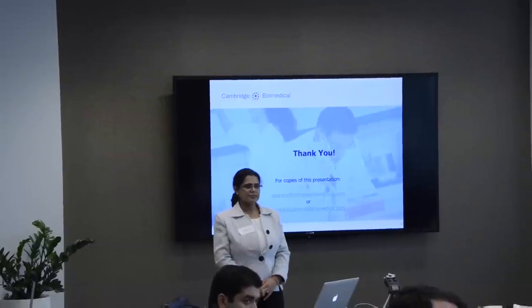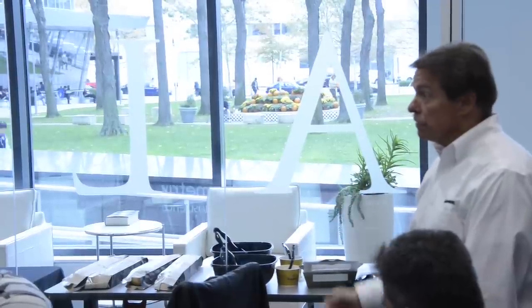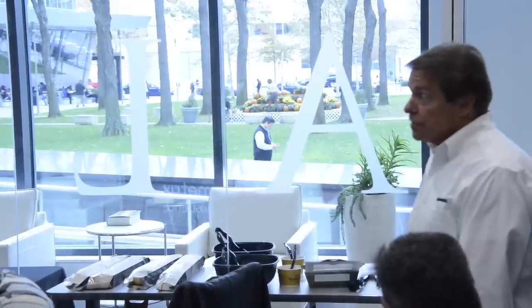So there are different ways of dealing with matrix effects. What we're doing at Luminex now, just so you're aware, is evaluating several technologies, many of which you're probably not even aware of, to be able to handle that. We have very stringent validation protocols in place, working with companies, some of them here in the Boston area. It's pretty exciting to see some of the data, and some of the claims that some of these matrix solutions make aren't true. We're trying to sort through that before we get to these LDTs, where the guidelines come out and one company makes a claim as a reagent that removes matrix effect, and it's not true.